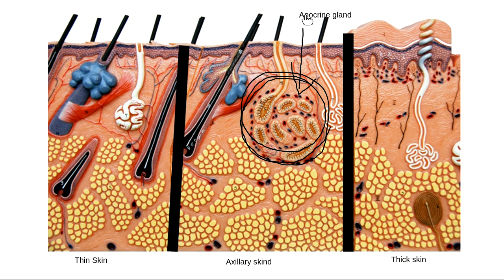We also have, though, I'm going to try to circle it, and we can see it in multiple places. See that little white one that I tried to circle? I'm going to circle it again over in thin skin too, because it's the same thing. We can see that gland that's white. My tip off with this white gland, notice it goes all the way to the surface of the skin up here. So this type of gland is called an eccrine gland, an eccrine gland. Eccrine glands, these white glands here, these make the watery sweat that cools you off.